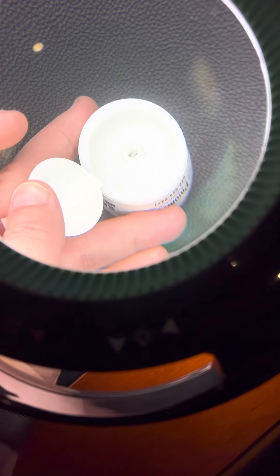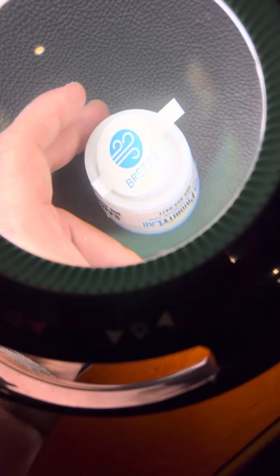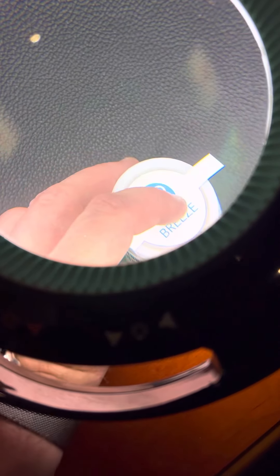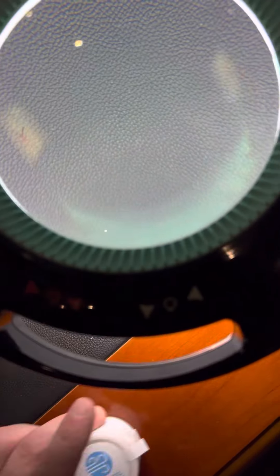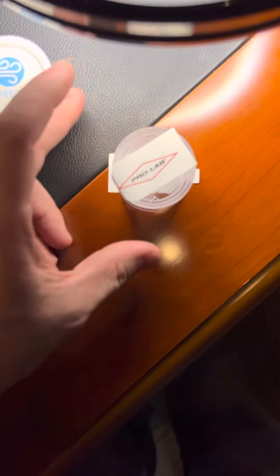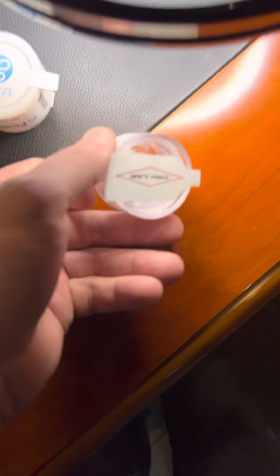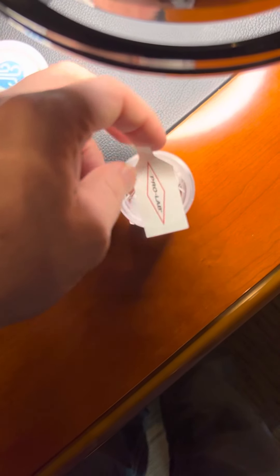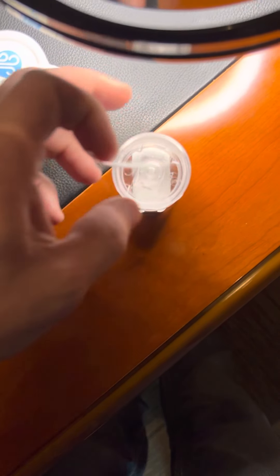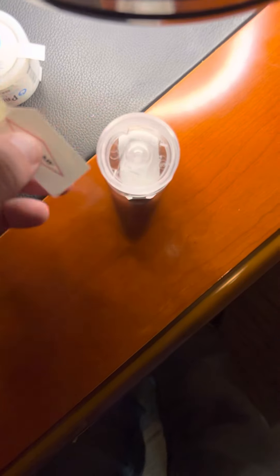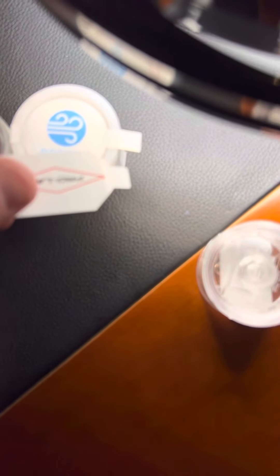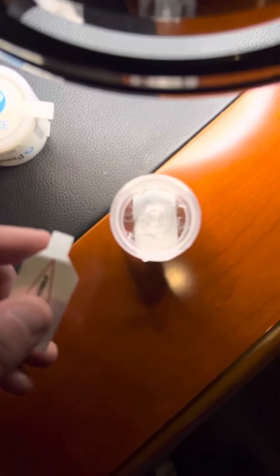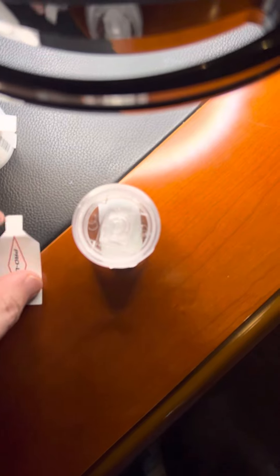The reason that you won't see any branding from Zefon is because we poured this. This is plastic injection molding that we do in high volume. This product supposedly made by ProLab is a little different. They have the stickers you can take off, pretty cool. I wonder where they got that idea, but let's put that aside for a second.